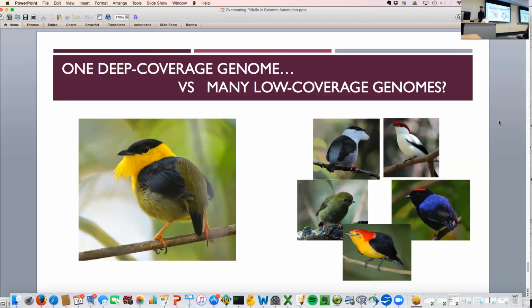What's your number of reads that you're calling deep and shallow? This is something to talk to Wes about, but generally for PacBio, I think 50 to 70 is deep, in my opinion. On the 1 million genomes, maybe 80, 90X. And the 48 genomes are of variable quality. They're all Illumina, and they're all about 100X roughly.